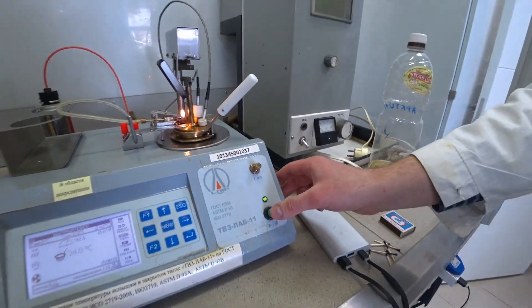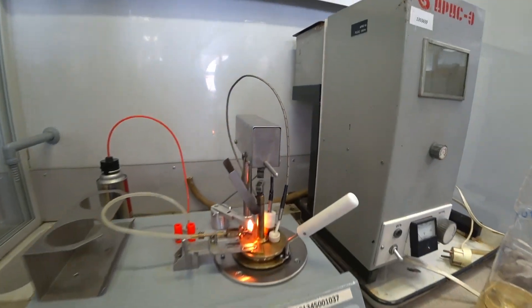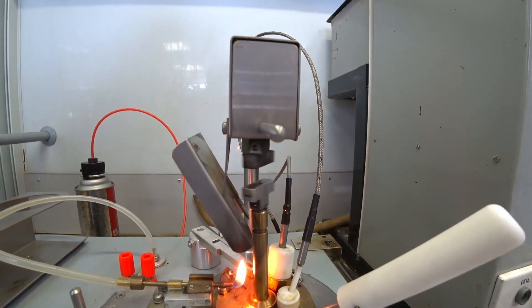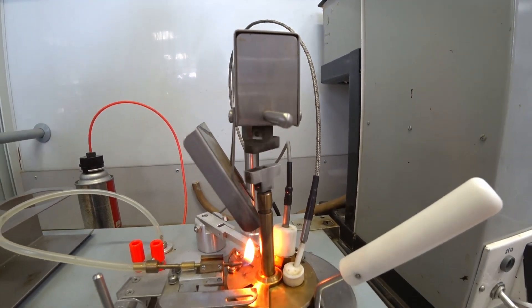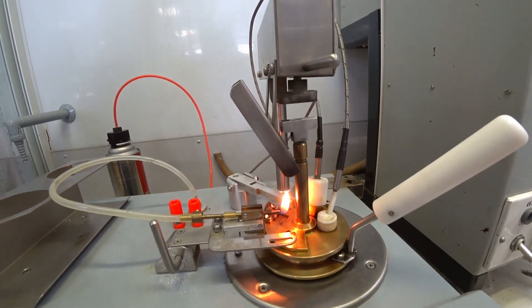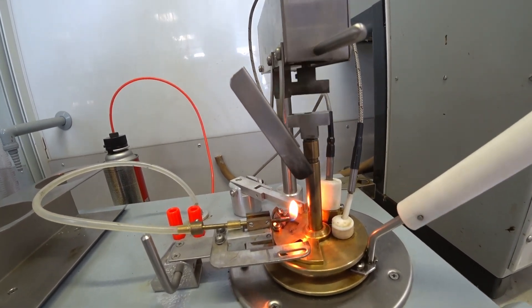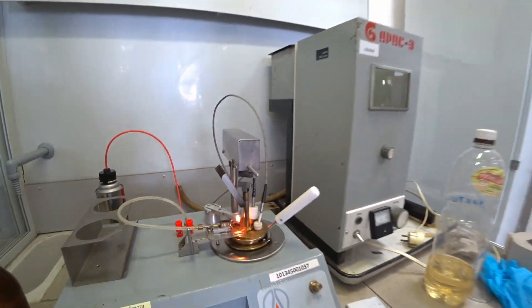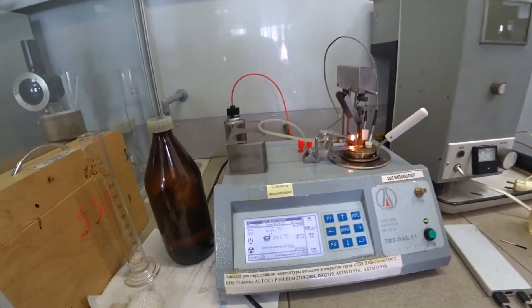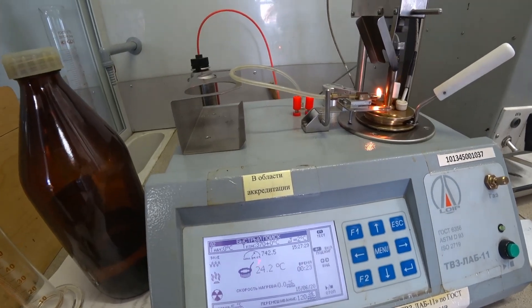Now we will carry out the experiment. As we can see, the arm itself is rolling to stir the fuel. And here is our information about the temperature in the closed cylinder.